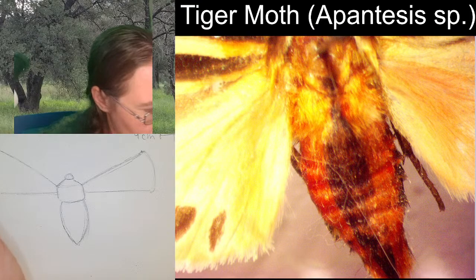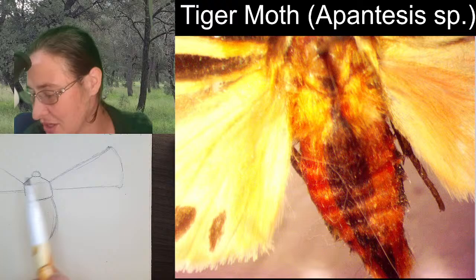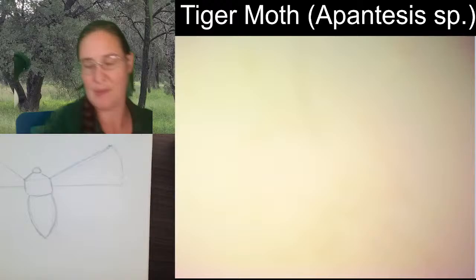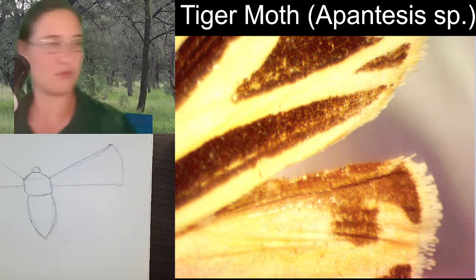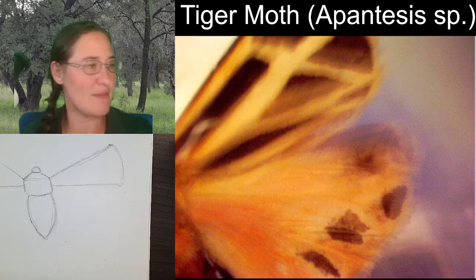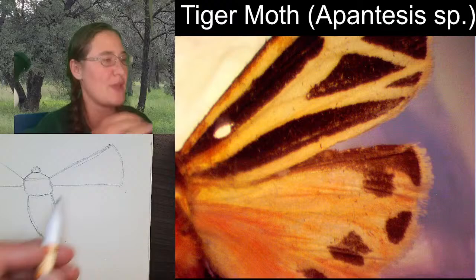And the left side is going to go off the paper a little bit, but I am only going to do the one side anyway, so we're good. All right, now, with my specimen here, I am going to sketch it with less of this space here. Maybe I'll show you that under the microscope. So you see how there's that larger gap in between the front wing and the hind wing? Generally, nowadays, I don't like to leave that amount of gap between the front and the hind wing. So I'm going to pull it up a little bit and kind of imagine it more connecting here. That's what I'm going to do.